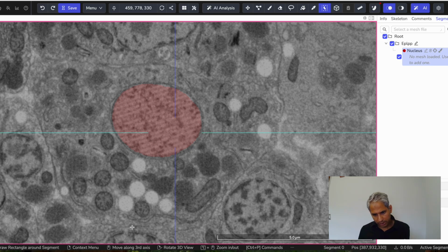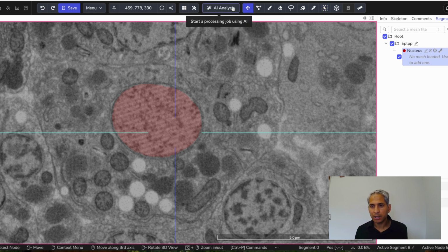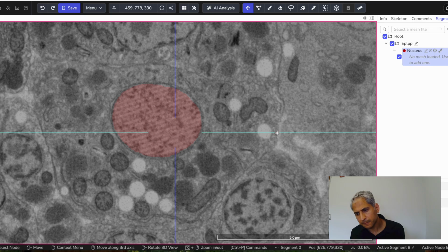It gets a little bit dubious here. But I can see, oops, accidentally quick select, undo, here's your friend. Let's stay here on the move tool so we don't do that again. I can see here plasma membrane, and then it seems that the cell goes up like here, and then squiggle, squiggle, squiggle, up until plasma membrane over here.